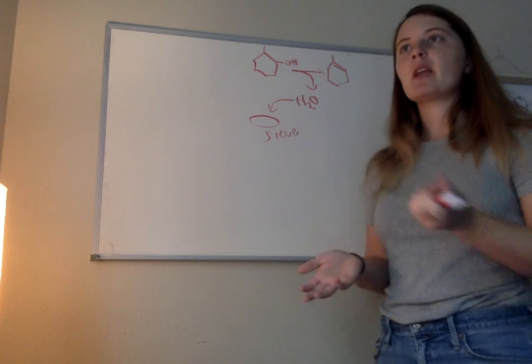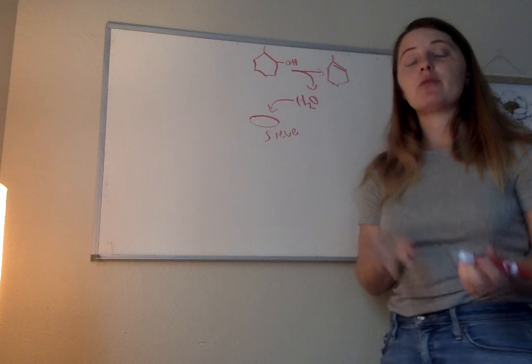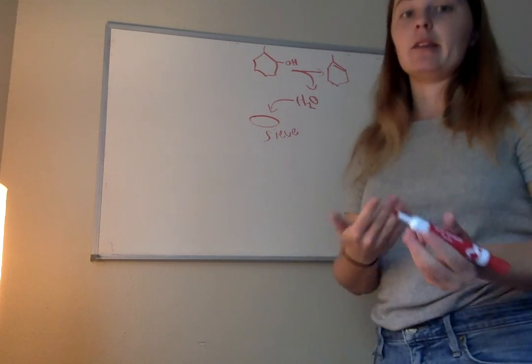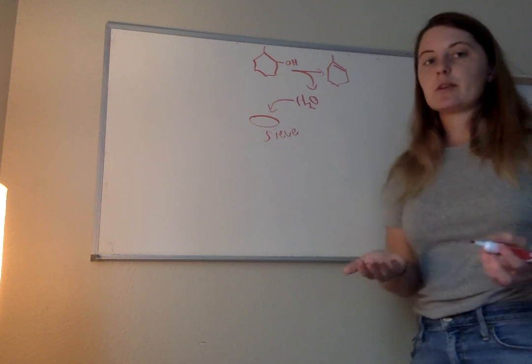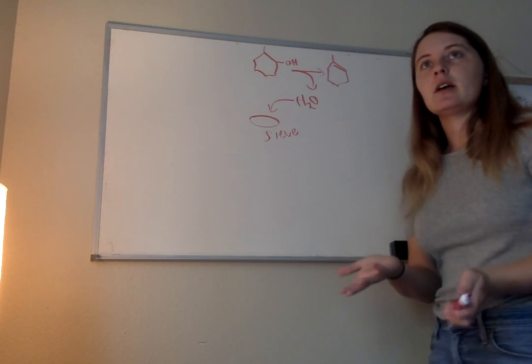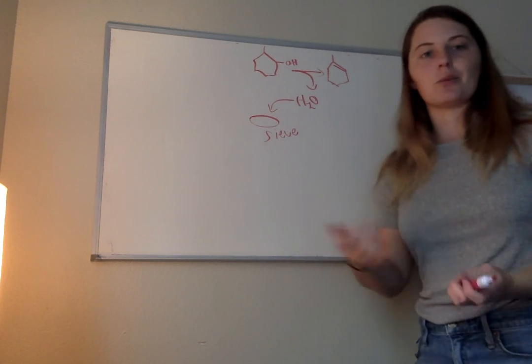And that's why we use it. It's a little confusing because with using 85% phosphoric acid, you actually do have about 15% water in the mixture already. So it's probably inundated with water, but through experimental analysis, we found that using these sieves is still pretty effective.